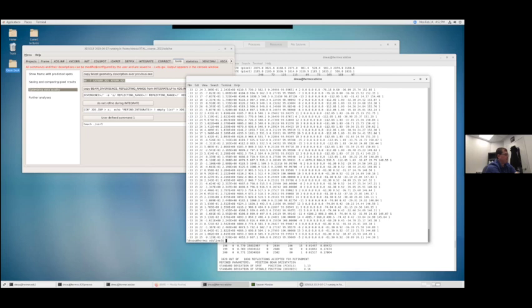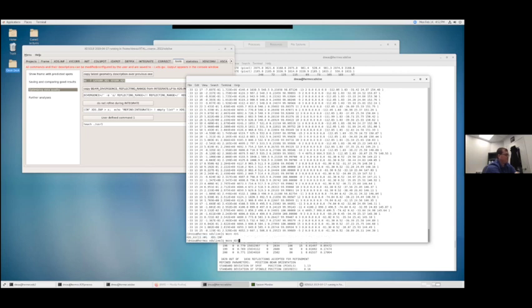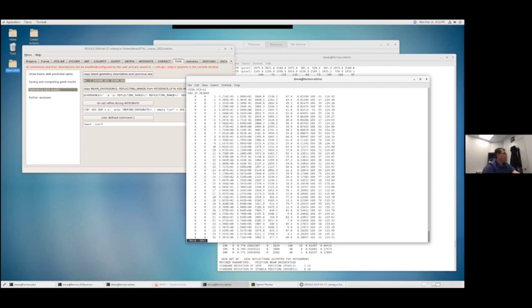Again, it's not something that you generally are going to look at. In the XDS_ASCII, this is what comes out of correct. Again, it's similar. It's giving HKL values along with an intensity and an estimate of the error of the intensity, as well as positions of that.